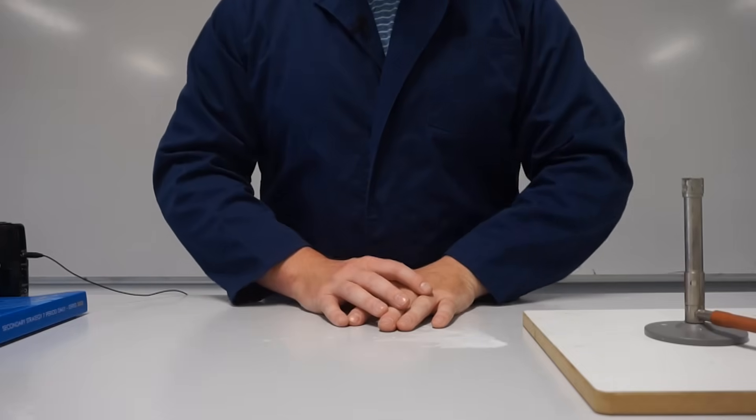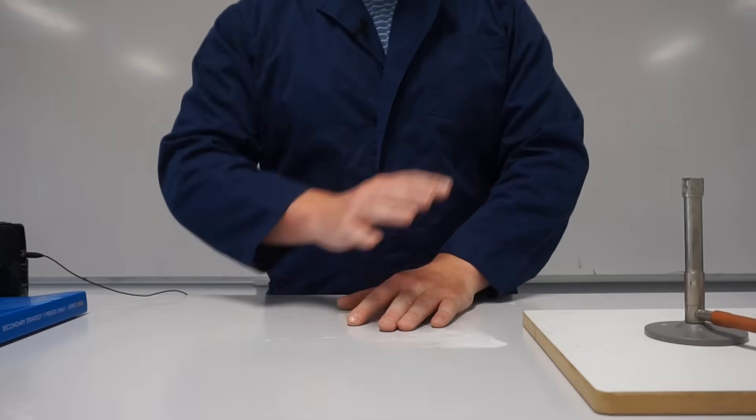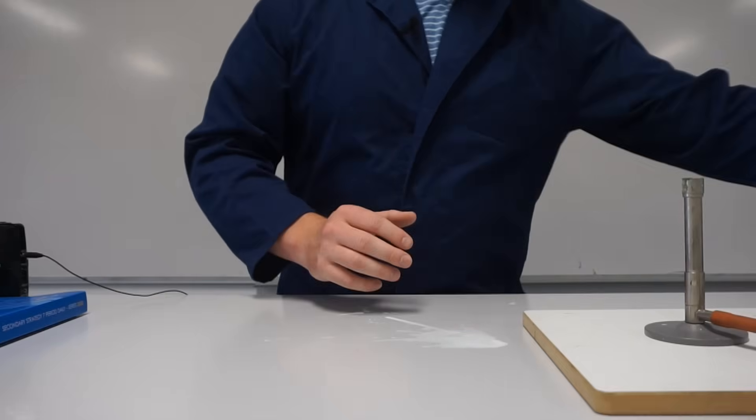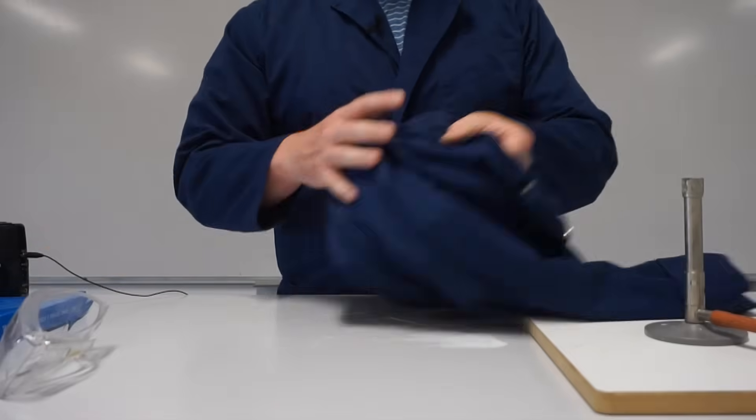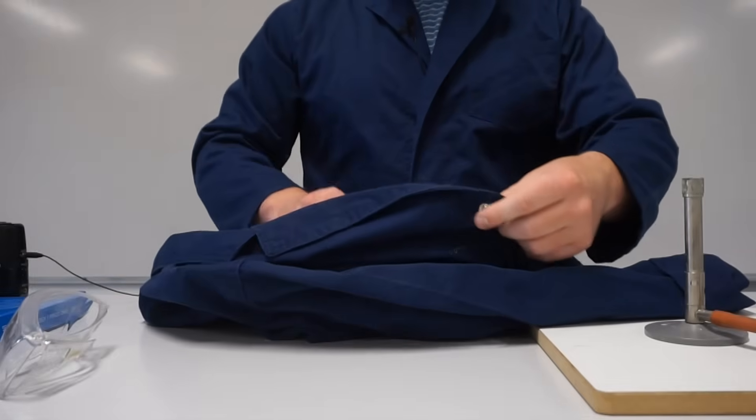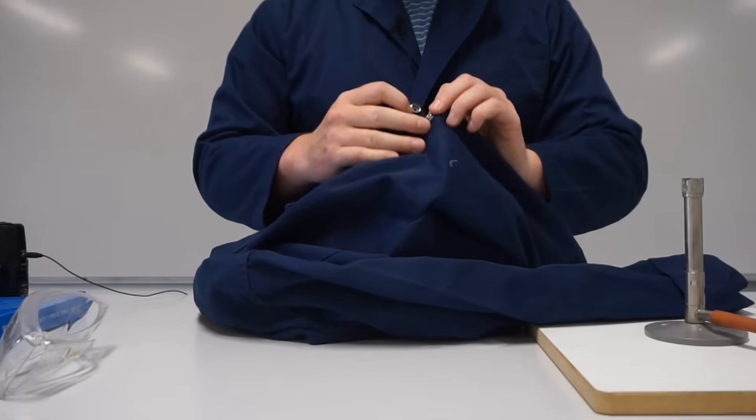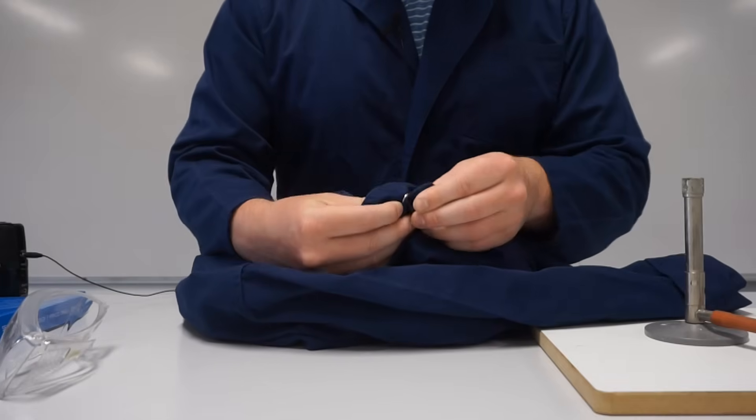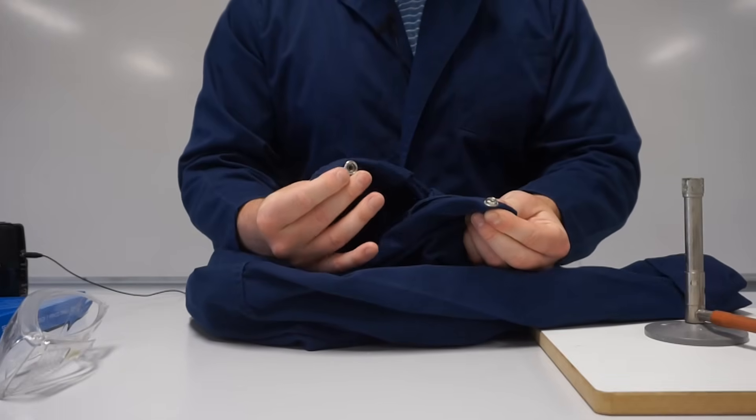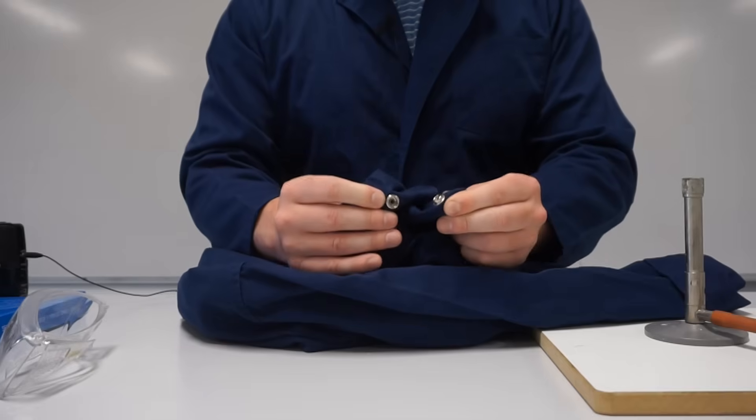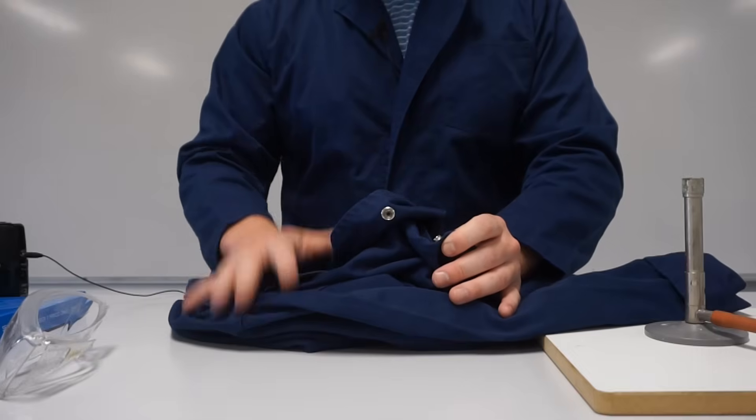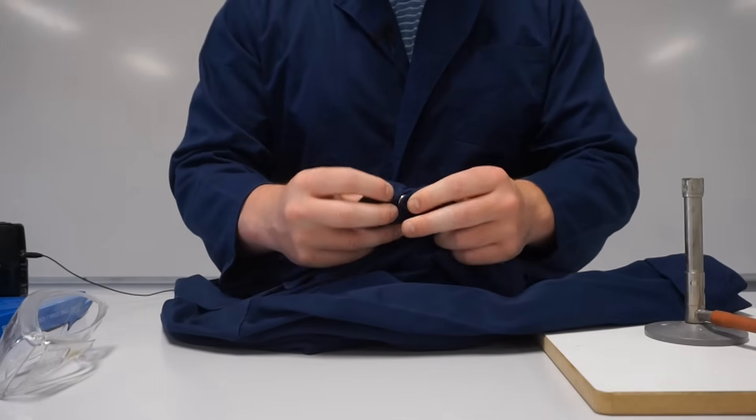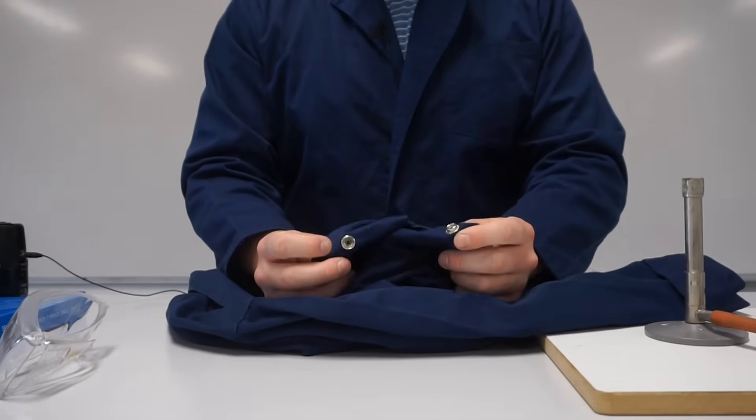I also just want to explain some of the safety equipment that you should have with you when you're using a Bunsen burner. That includes your safety glasses and your lab coat. Your lab coat should have press studs as its method of doing up and these press studs are really important because if your lab coat does catch fire, if there's some sort of emergency and you have to get this off really quickly, the press studs will allow you to take it off as quickly as possible.